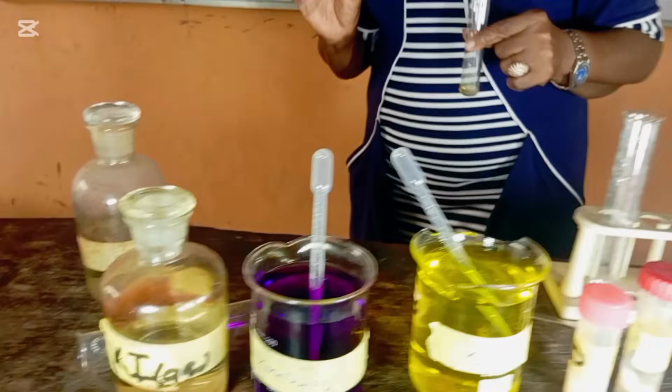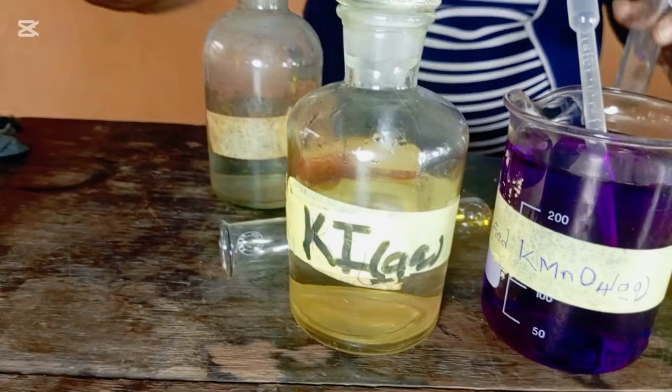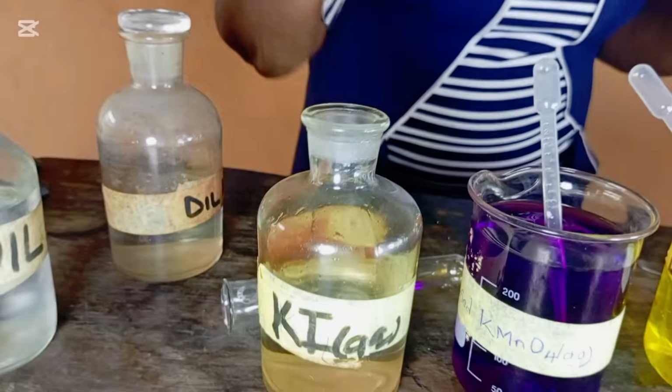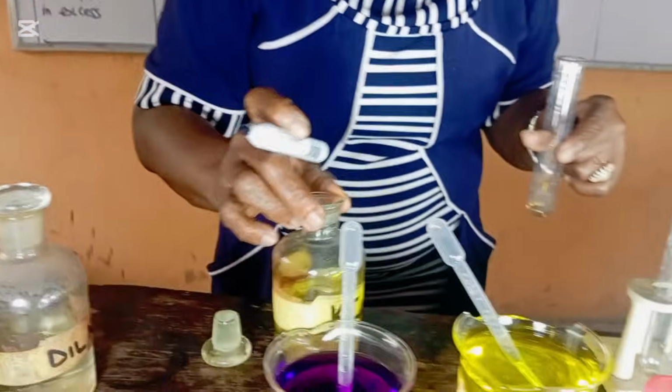I have to use potassium iodide. I have potassium iodide here. Make sure you look at what you're adding before you add.